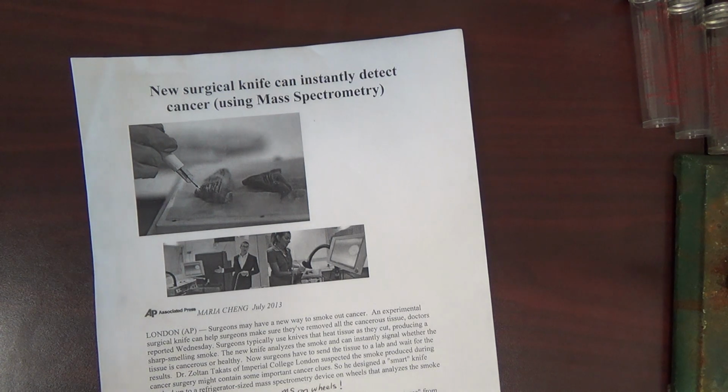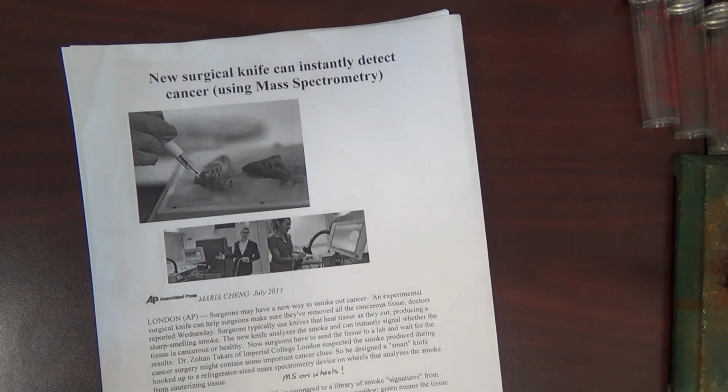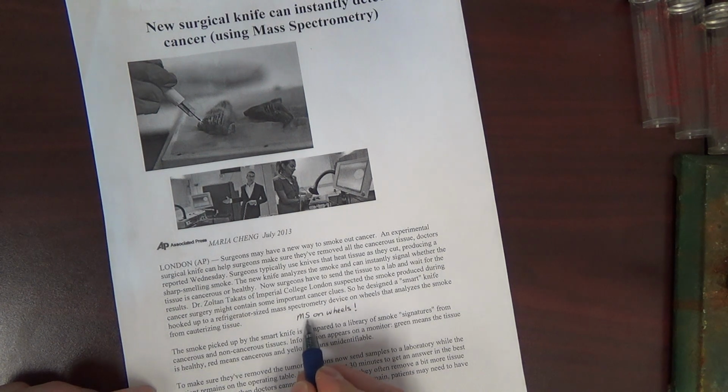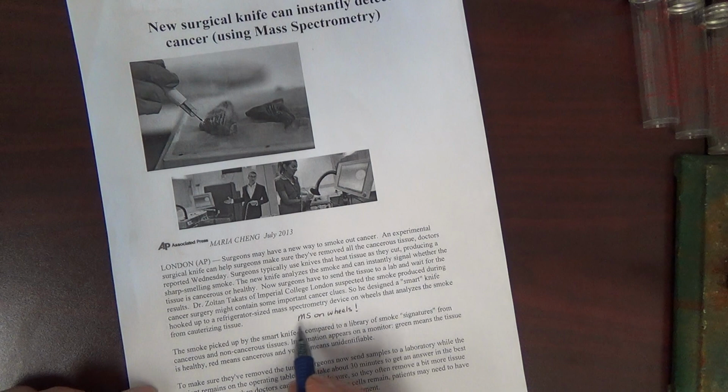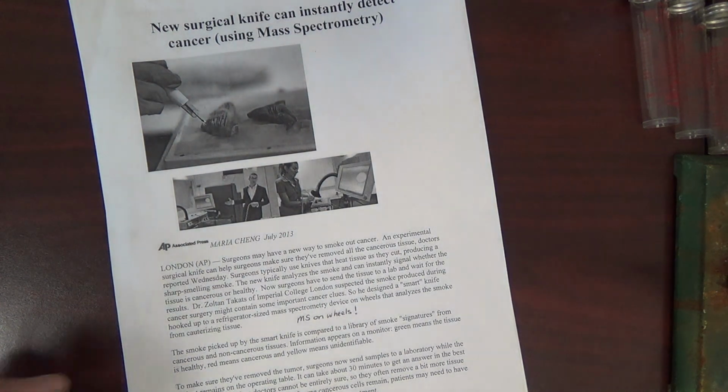Now this opening page shows an application of mass spec towards medicine, towards the analysis of potentially cancerous tissue. This shows where the instrumentation has been taken into the so-called clinic and been more broadly useful towards medicine. Once we go through mass spec, you can then look back at this and hopefully it will be more relevant. Note that mass spec can even be shortened to just MS, typically. So in this example, they have taken mass spec and put it on wheels, and so they can roll it into the clinic. Interesting application.